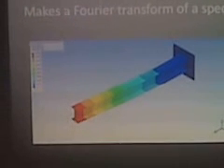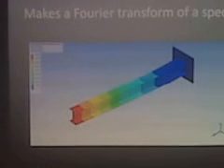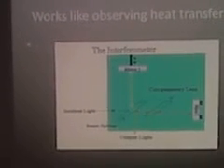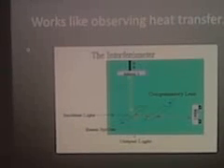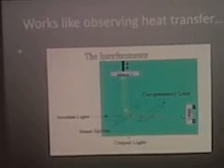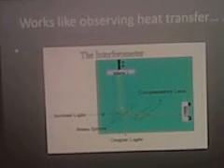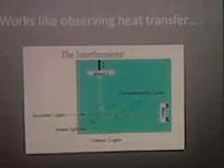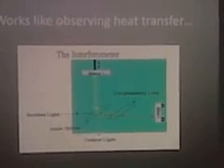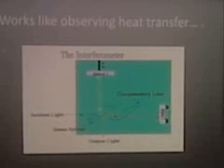The best way I can explain Fourier transformation is if you had a fire poker in a fireplace, and you were heating up the coals. Heat travels through maybe an iron poker, molecule by molecule, till it goes up to your hand. So heat transfer is an excellent way to explain Fourier transformation without a lot of mathematics. The interferometer, again, is composed of two mirrors and a beam splitter.